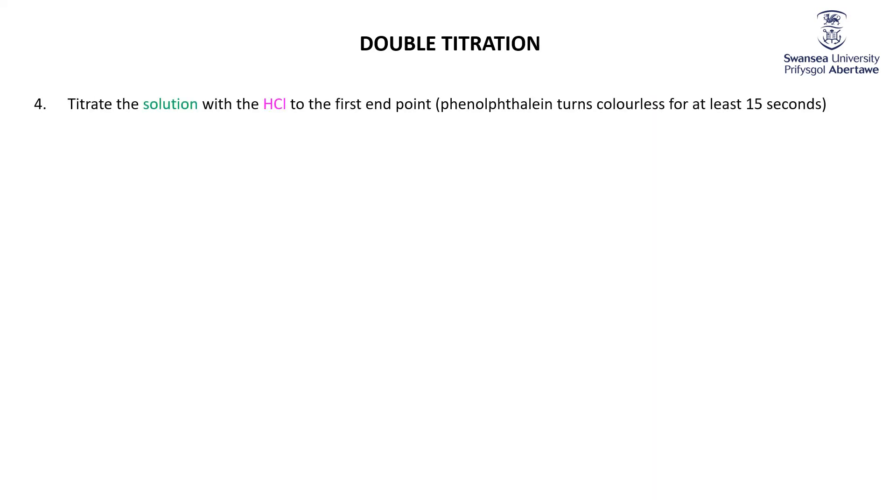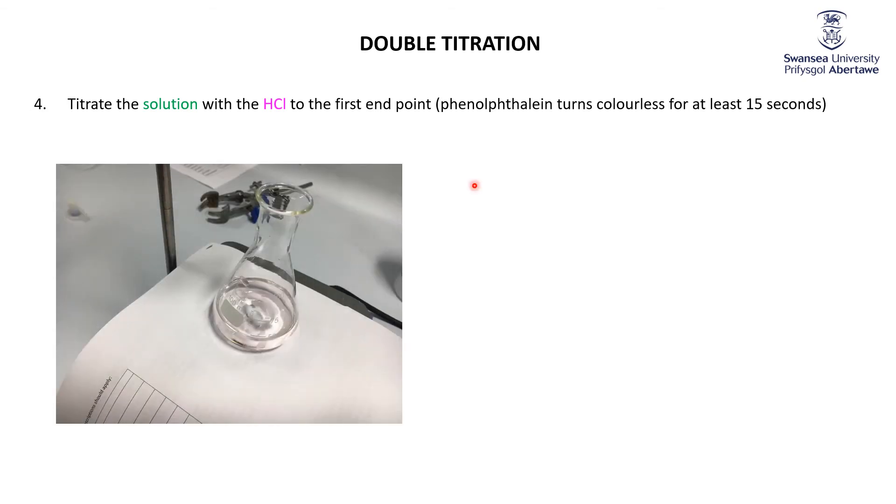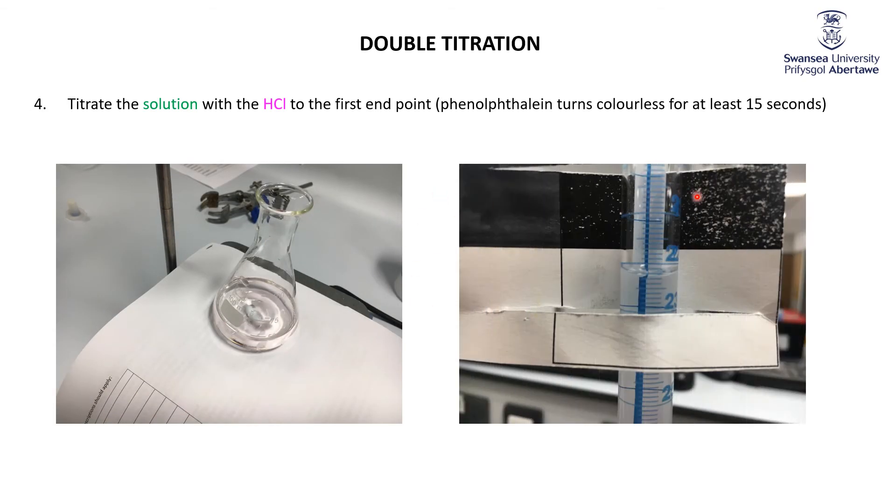So I'm going to titrate it with the HCl to the first endpoint. Here's my colorless phenolphthalein. That happens once we've added about 22.2 millilitres of HCl. So in other words, we've added about 22 millilitres of HCl to get rid of the sodium hydroxide, and all the sodium carbonate has turned to hydrogen carbonate.